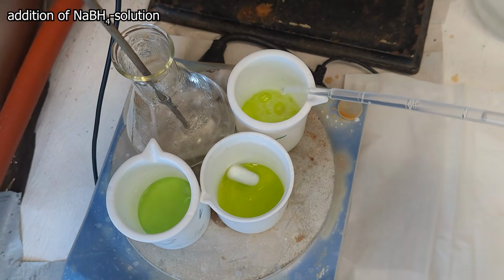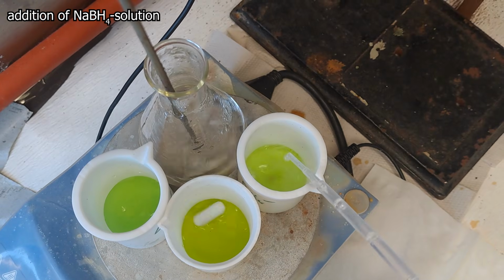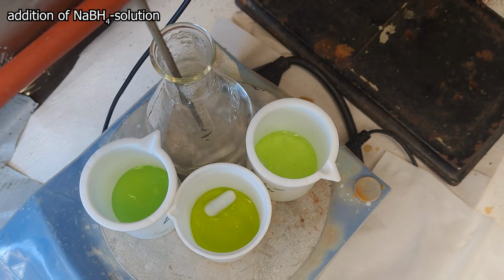Hopefully, this has given us a few insights into basic chemistry of uranium. There is much more you can do with tetravalent uranium besides simply precipitating it as a fluoride, but these would be other exciting syntheses that we can carry out here at the university.